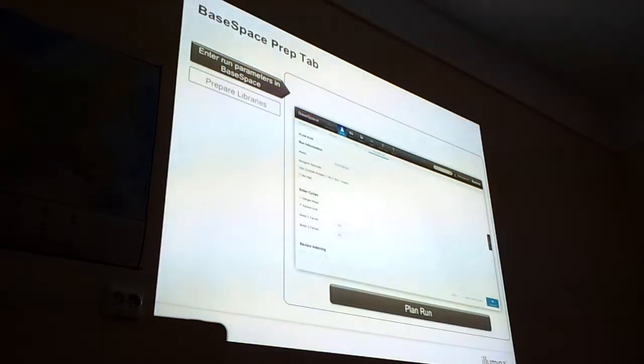Because you can modify it, yeah. As you said before, you can make it shorter if you want, but obviously not longer. If the kit allows you 300 cycles, you don't have to use them all. So this is the maximum what you can do, 2 times 151. Yes. But always one more, you know this. But if you, for some reason, decide to do only 80, that's where you can do it in BaseSpace. Okay.